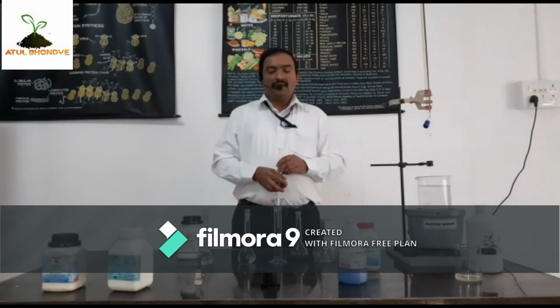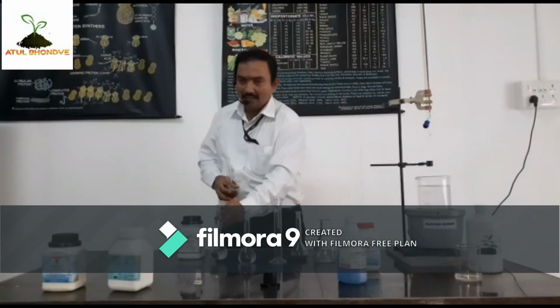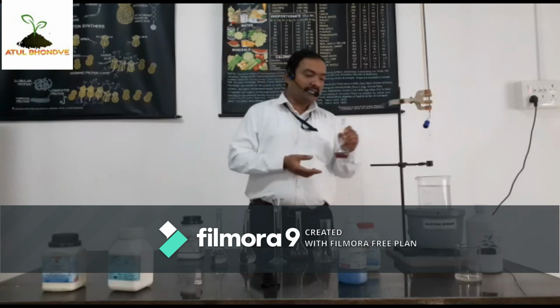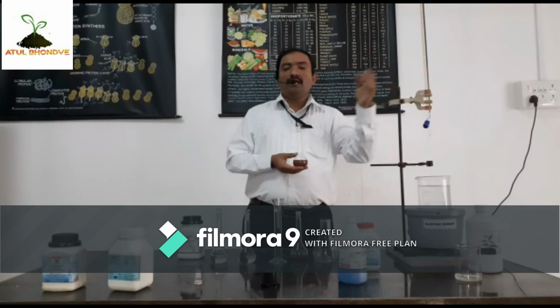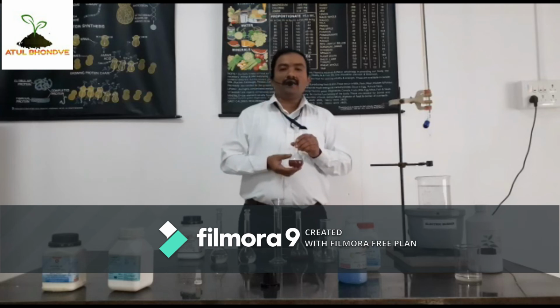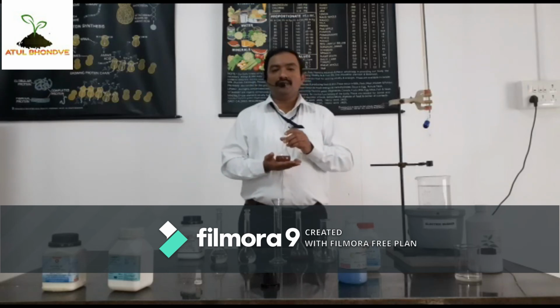So for the second practical, again we use the test solution, solution of lactose and solution of fructose, and the Benedict's reagent is added into the volumetric flask: 25 ml of Benedict's reagent plus anhydrous sodium carbonate. We boil the content, and in the burette we fill the test solution, and then drop by drop we added the test solution, the solution of lactose and fructose, into the Benedict's reagent, and again we observed the color.